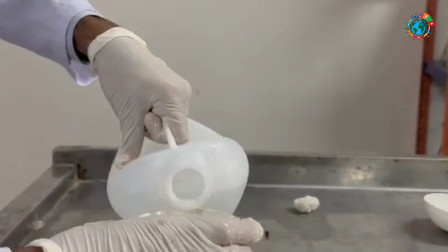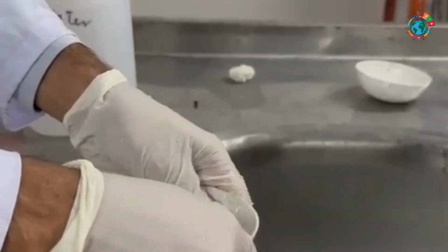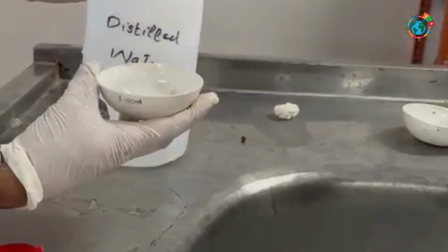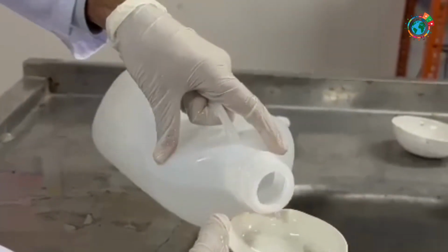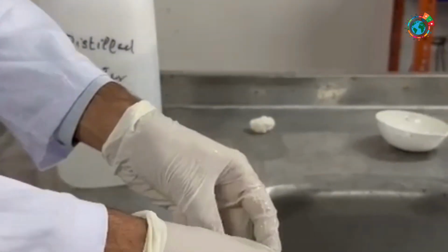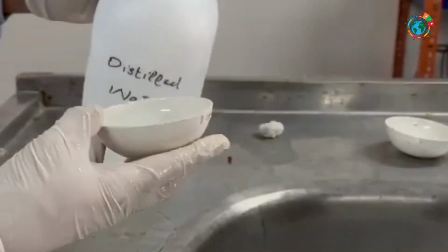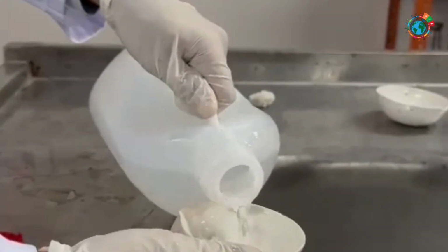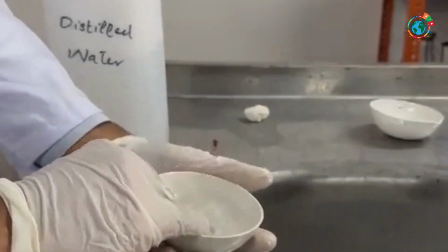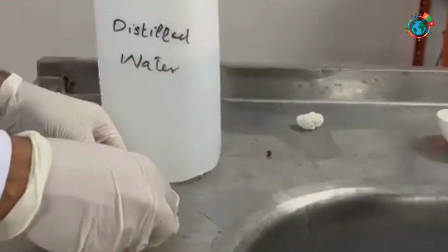Washing a China dish with distilled water 3 times involves using distilled water as the rinsing agent to clean the dish thoroughly. This process helps ensure the removal of any impurities, residues, or contaminants that might affect subsequent usage or testing of the dish. Rinsing 3 times with distilled water guarantees that the dish is free from any potential contaminants that might affect its use in subsequent experiments, tests, or analyses. This meticulous rinsing process helps maintain the integrity of the China dish, especially in laboratory settings where precision and cleanliness are crucial.